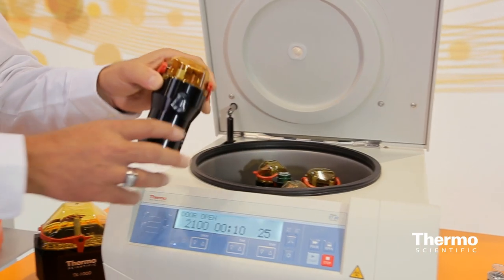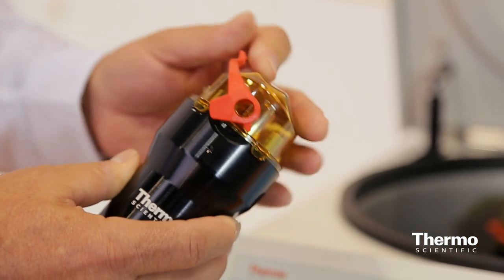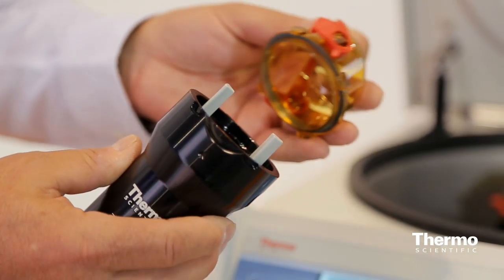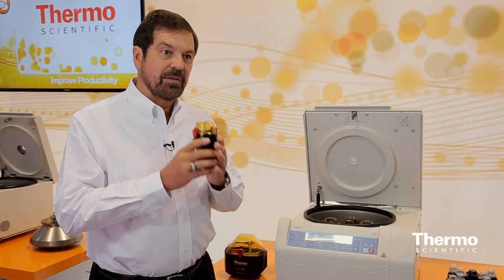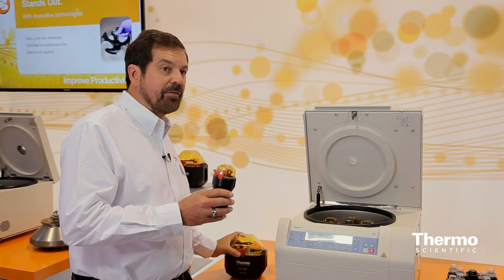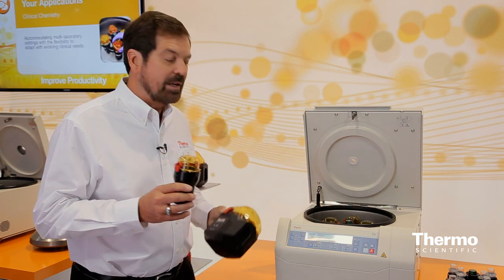To do that, we've introduced a click seal biocontainment system so that all you need is one finger and you have a certified biocontainment seal. This smaller product holds up to 24 blood tubes, but we also have a product that can go up to 196 blood tubes, so we really cover the whole spectrum of customer needs.